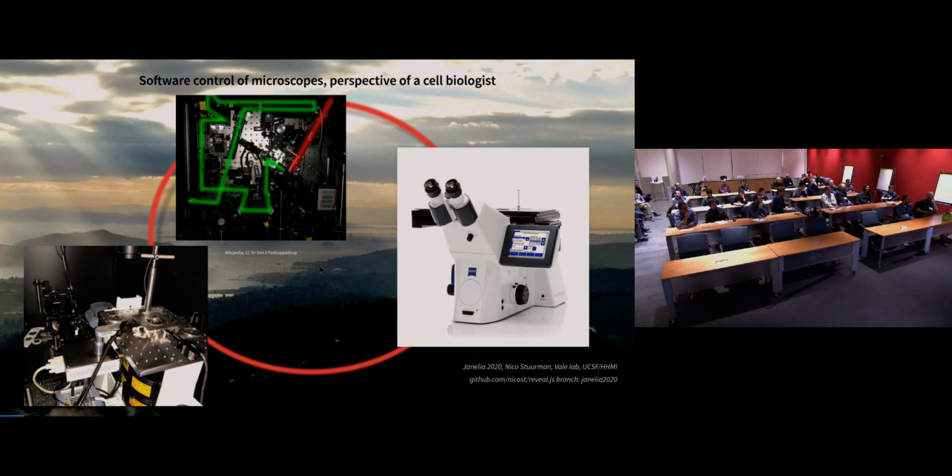It's very clear that that is not an easy task. It's also very clear that the components, the parts to easily share and work with each other, are simply not there. And so I'm now going to tell you a story about Micromanager, but I really want to place that more as an example of a similar project. Micromanager has certain things to offer to this problem.